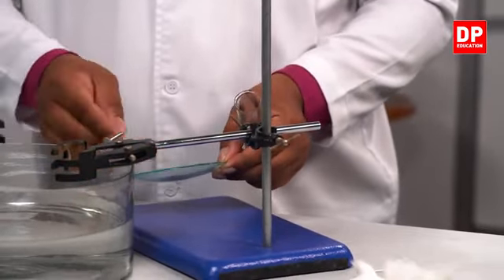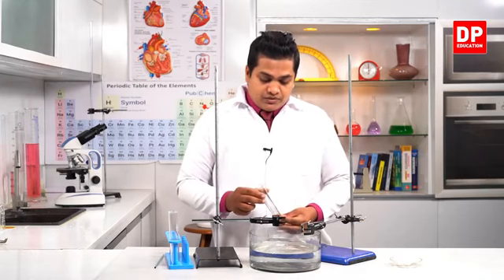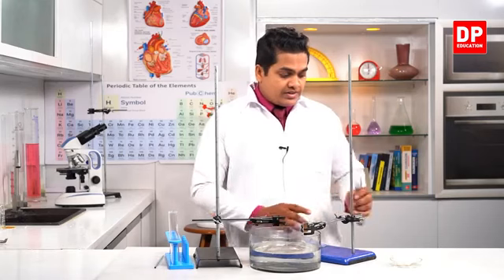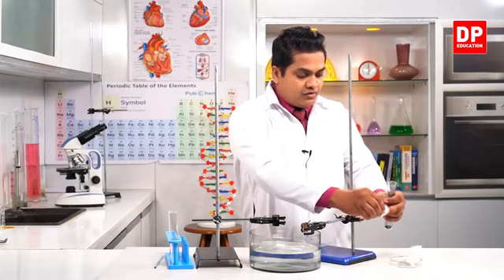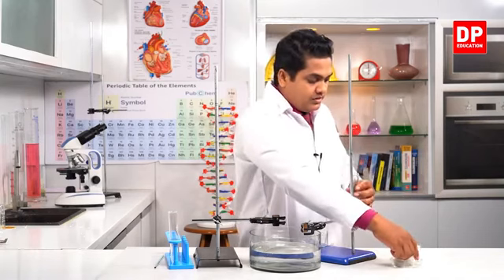Then we need to place this boiling tube inverted in this water trough. I can't directly keep it inverted in the trough, because the iron powder will fall into the water trough. So to avoid the iron powder falling into the water trough, I'm going to take some amount of cotton wool and place it within the boiling tube.